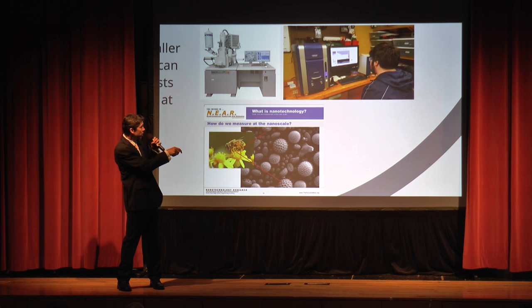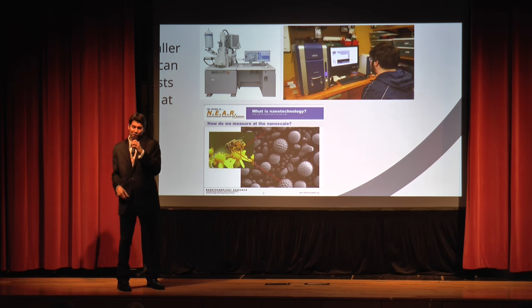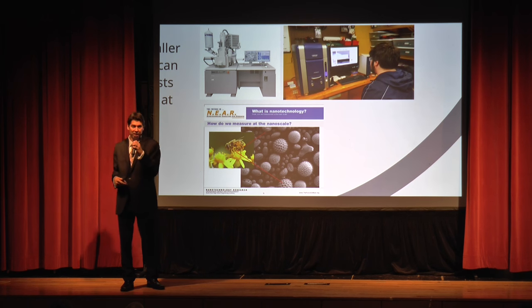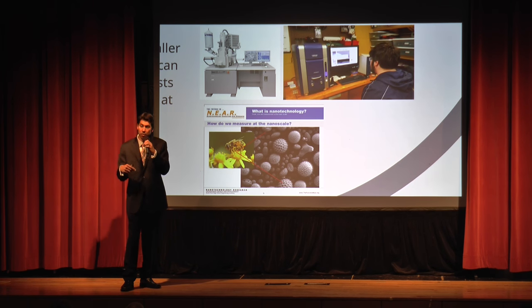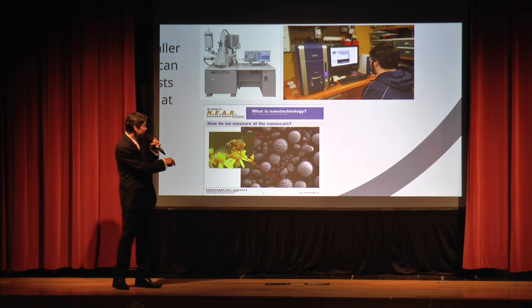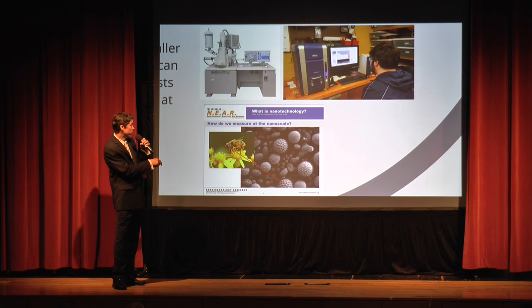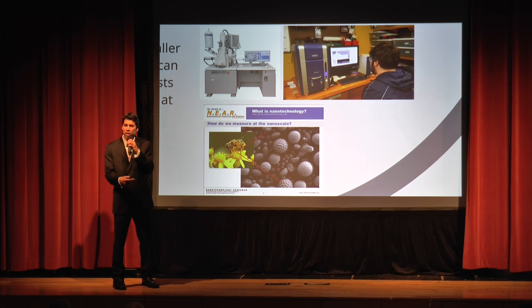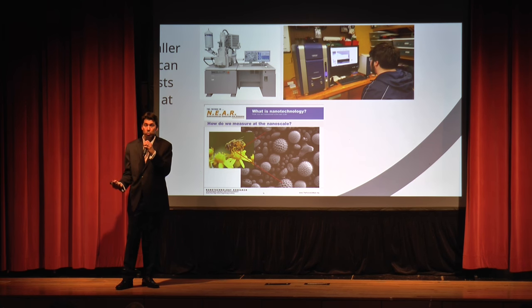The SEM right up here, you can see one of our students currently working on one. And actually, from Angstrom Scientific and Hitachi, we have an SEM demonstration tonight for you to see what they look like and how they work. They're really amazing. And you can see an example of what pollen looks like. You see the pollen on the bee, and here you can see what it looks like under higher magnification. Pretty amazing. So these students are using the SEM to see things that are typically invisible while they're researching. It's pretty cool.